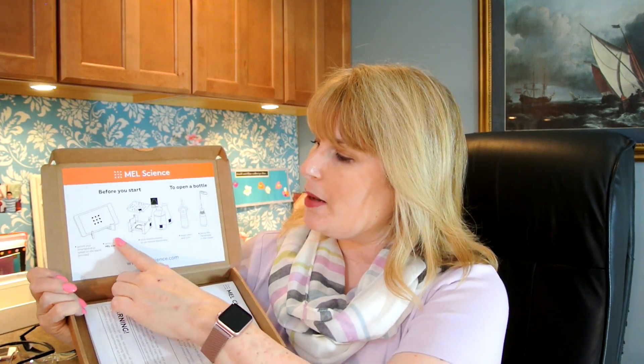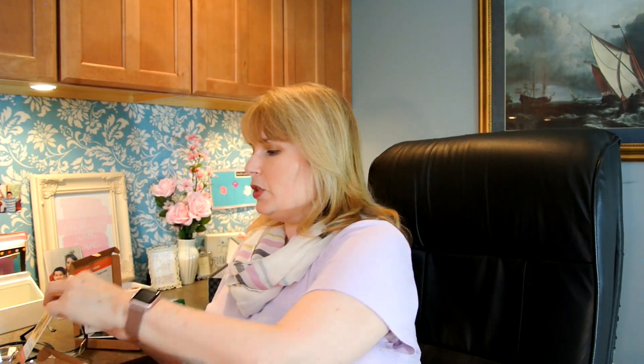In here you also have sheets of aluminum foil, and then you have hexamethylene tetramine and sodium hydrogen carbonate, which is baking soda. Again, you have several packets of it. And then you have a little scooping spoon and something else I'm not sure what's for. But the before-you-start section has step-by-step directions. That piece I wasn't sure about is actually designed to hold up your directions card during the activity — I said it looked like a picture frame, and it holds up the card. And there's one more small item — a stirrer with a little ball at the end rather than a spoon.